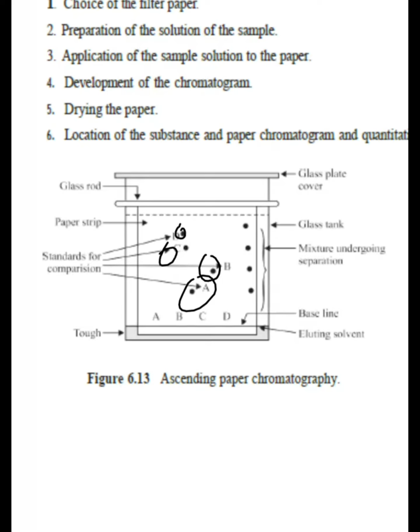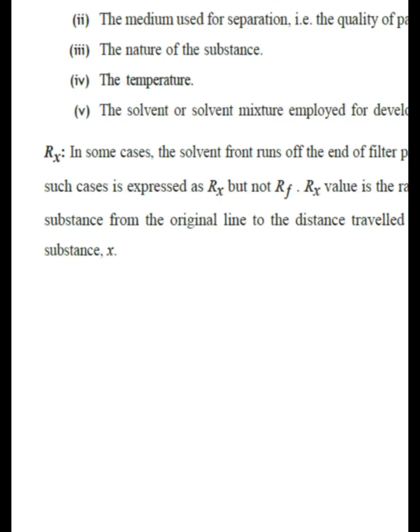This technique is known as paper chromatography. Here we are going to identify the compounds using the retention factor.